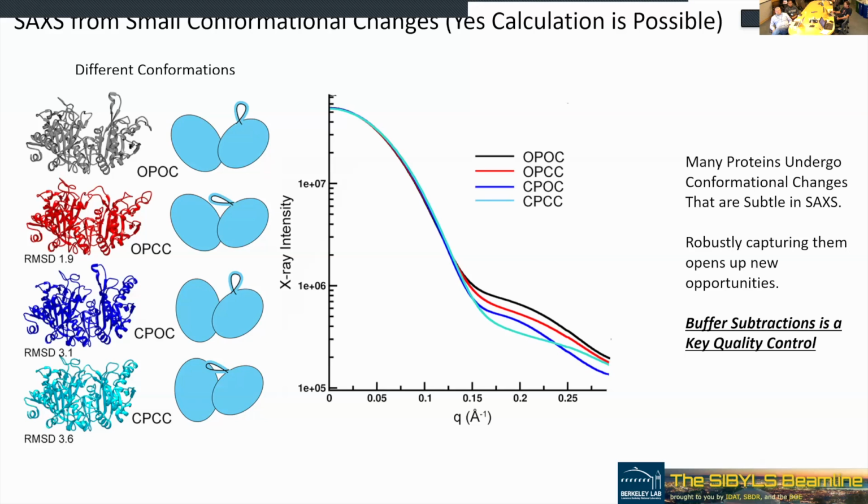Okay, so just this cap closing will give you a different scattering profile and a different P of R function than if the domains were shifted. So it's very sensitive to changes in position. I'm moving a little faster because I know I'm late.